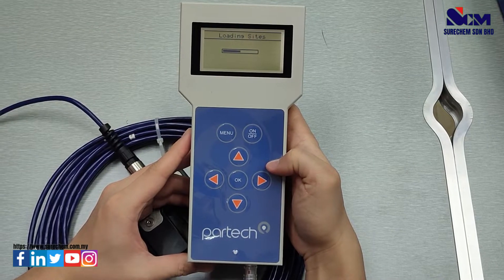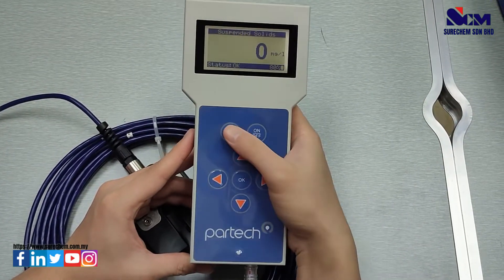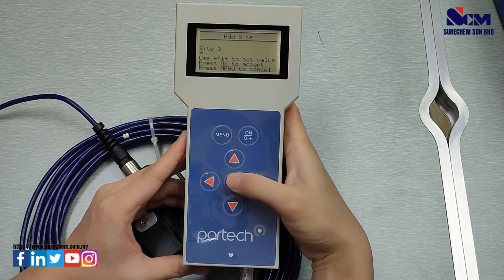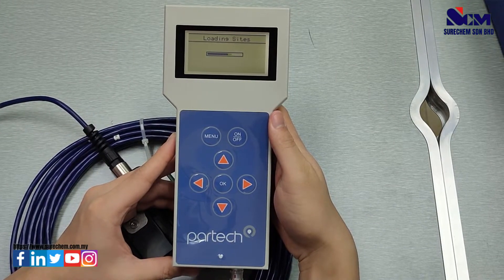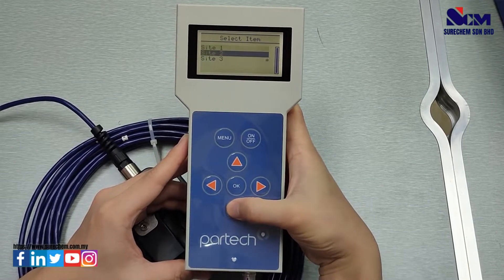Wait for the site to load. Go to the menu, go to Site, then go to Add Site, and create a new site by pressing OK.